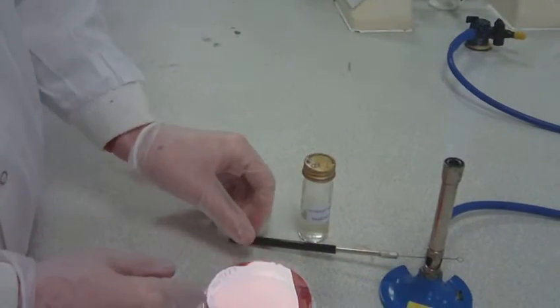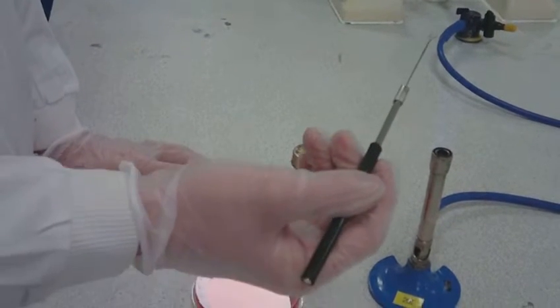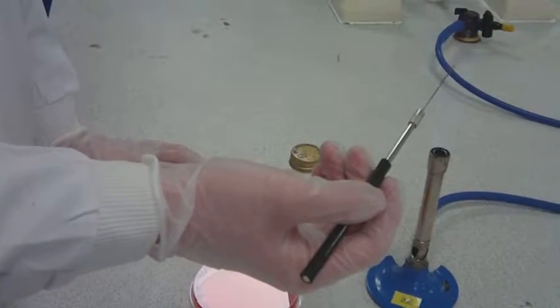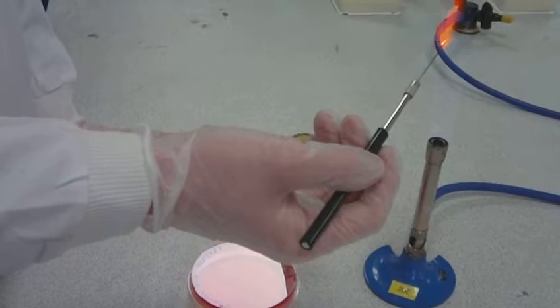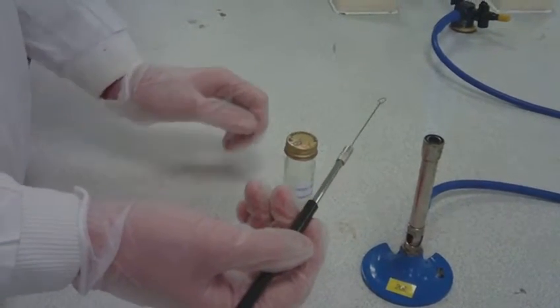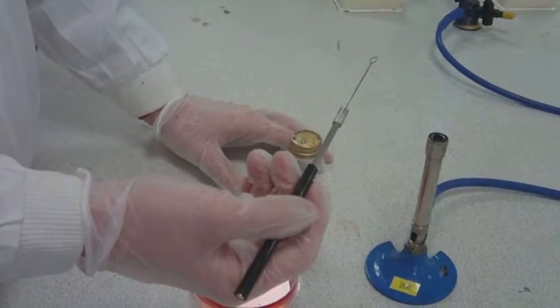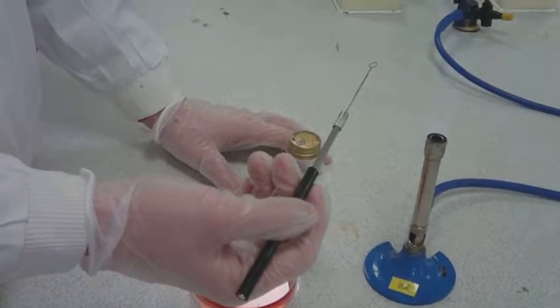Hold an inoculation loop in your right hand and put the inoculation loop through the peak of the blue flame until the wire is white hot. Then allow it to cool while keeping close to the Bunsen burner. Do not wave the loop around to cool quicker as it increases the chance of recontamination.